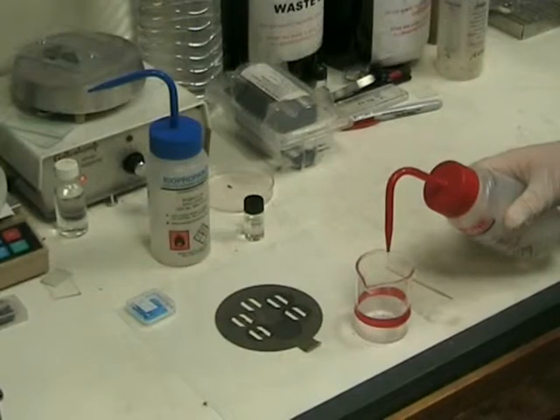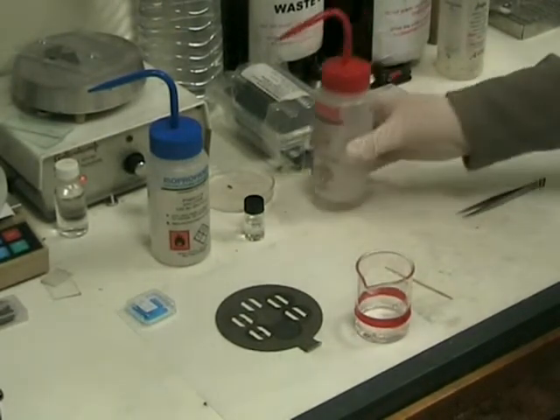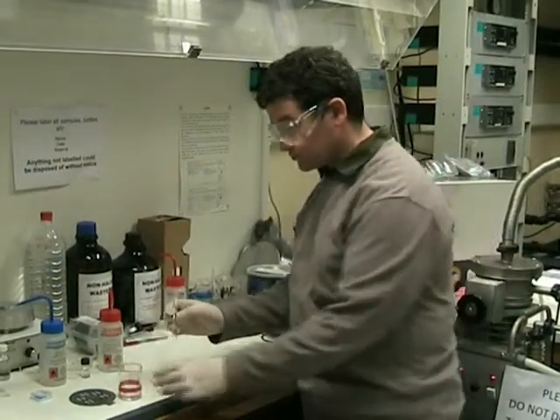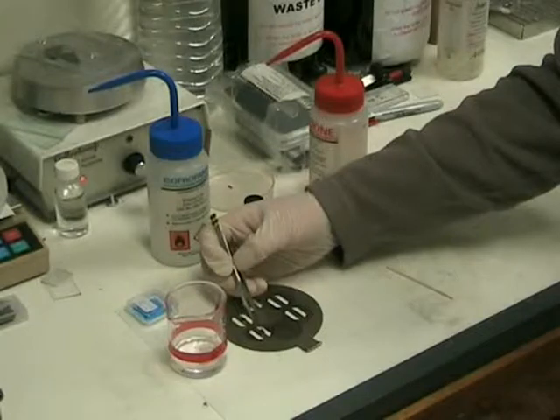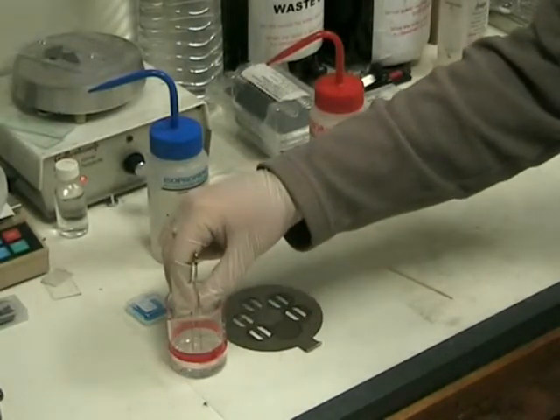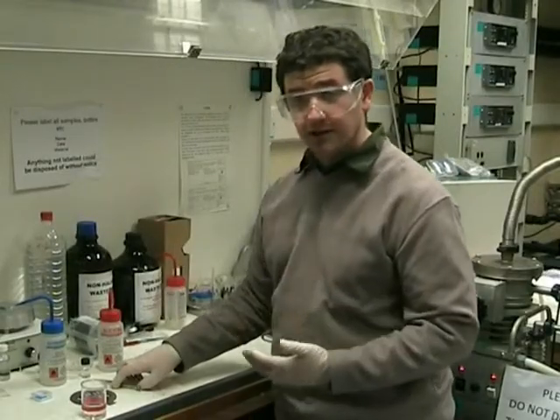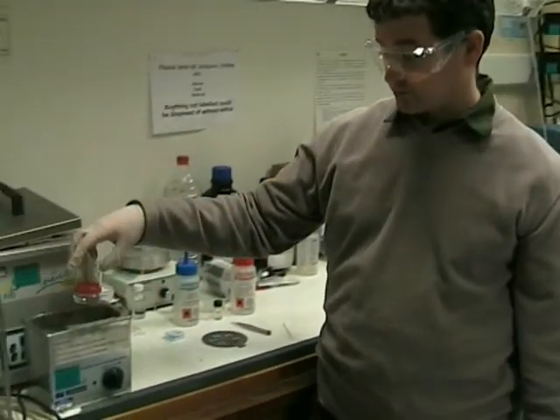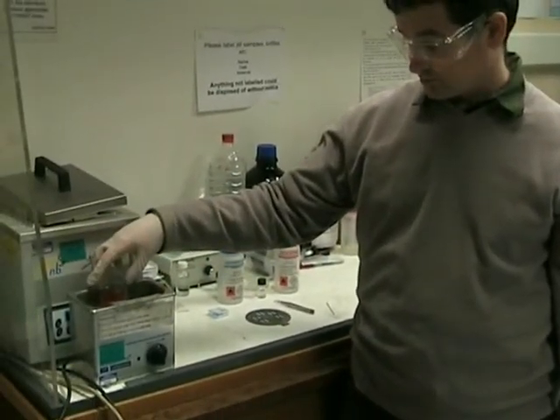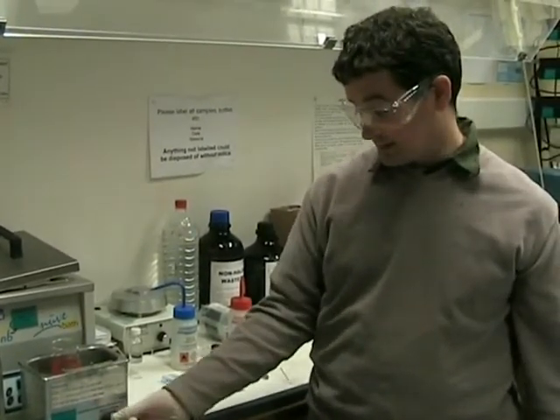Fill a beaker with a small amount of acetone. For acetone, use the beakers with the red marker. Take the sample and put it into the beaker, then put the beaker into the ultrasonic bath. Turn the ultrasonic bath to about the 2 minutes setting.